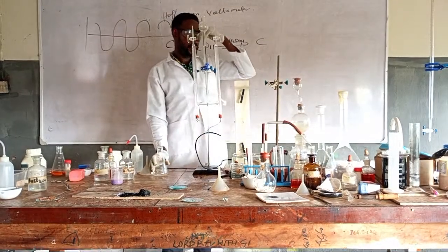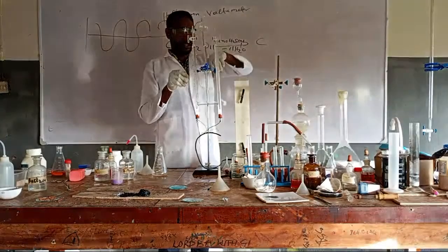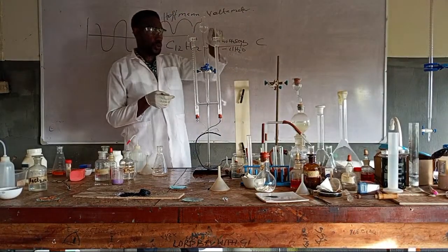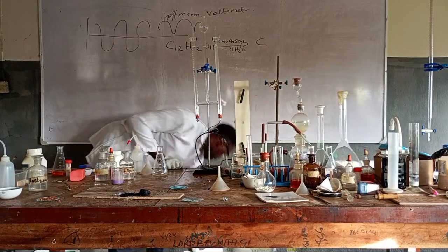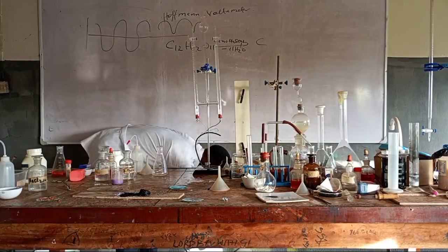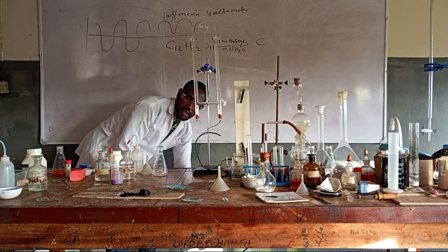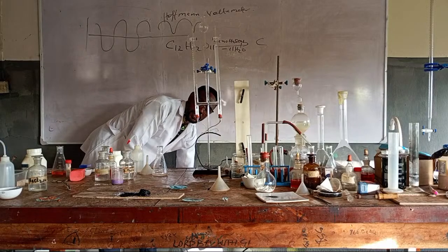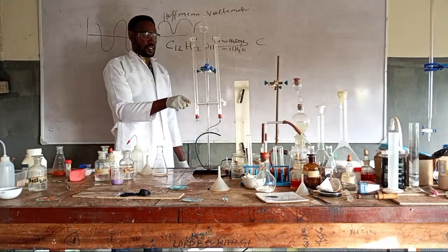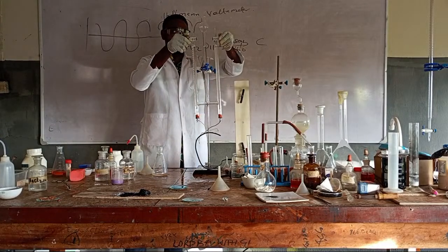I've overfilled it above 0, but no problem. Our aim is just to, we just pray that Nigerian NEPA is still here. Are they still here? We are not sure. Okay, you see? This is very, very fast. I've seen the speed. So I have to close this.